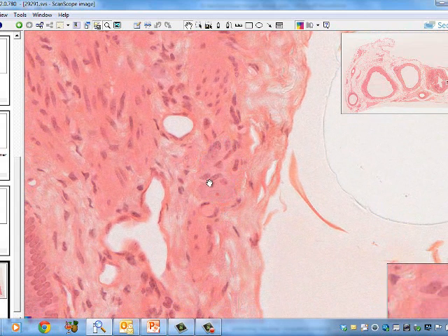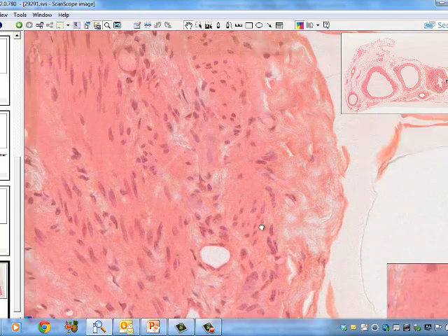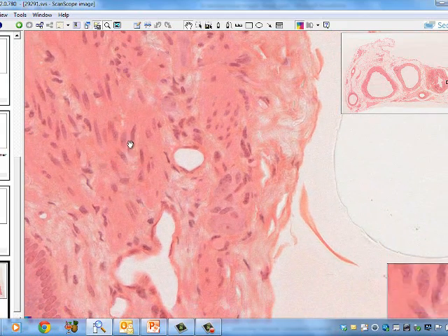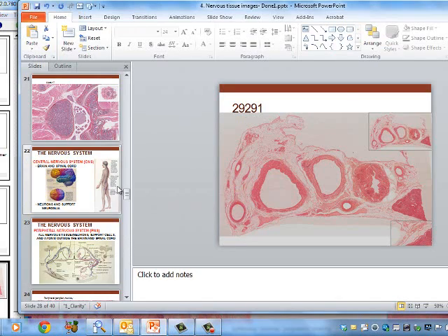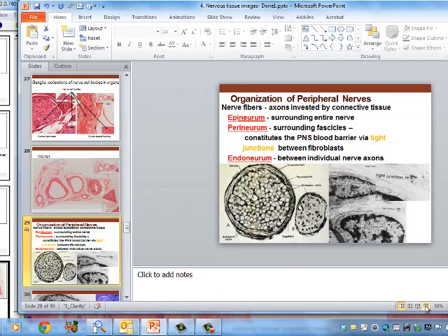These here are kind of grayer looking compared. There's another one right there, the other two right there, compared to the fibroblasts that we see in there. These are fibroblasts in through there. They are smooth muscle in through here, smooth muscle bundles as well. But these are fibroblasts over through here and like that. But these are smooth muscle cells here with the corkscrew nucleus is smooth muscle. But there's a ganglion cell, there's a nucleus, there's a nucleolus that we can see.